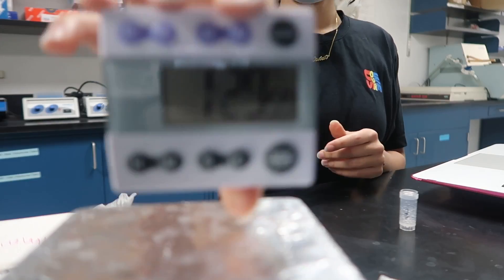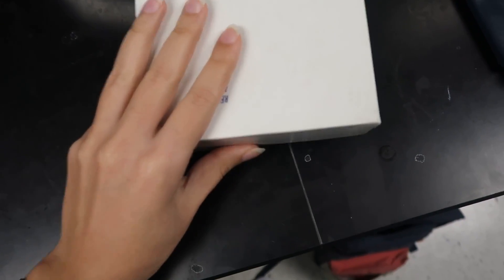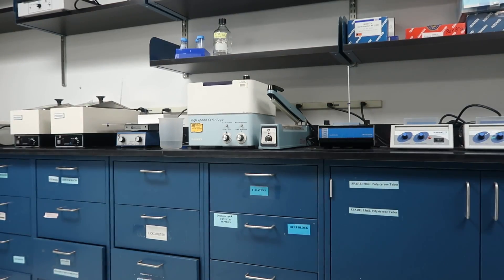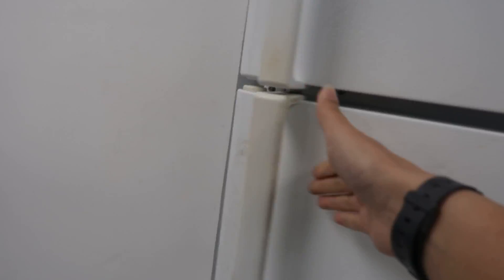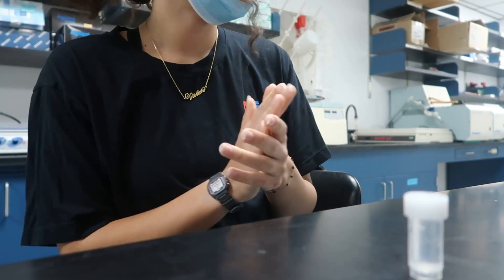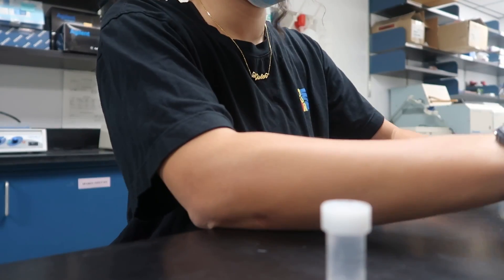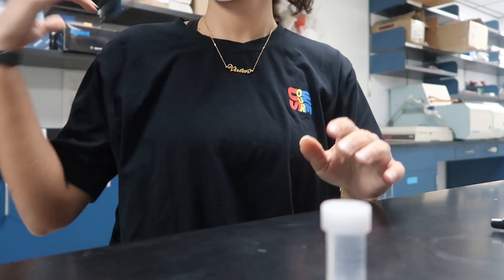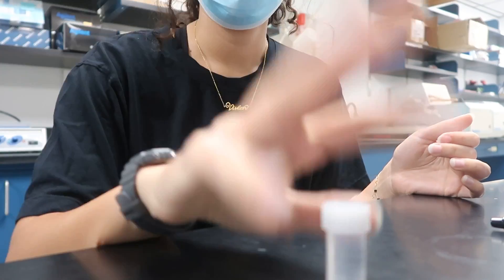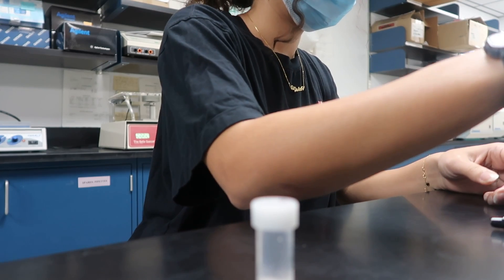Okay sweet. Set timer for five minutes. So after that five minutes is done, I'm going to block with normal donkey serum — I think that was about 500 micro. Okay, 500 micros. Ready? Just gotta wait for it to stop rinsing off, and then I block for two hours.